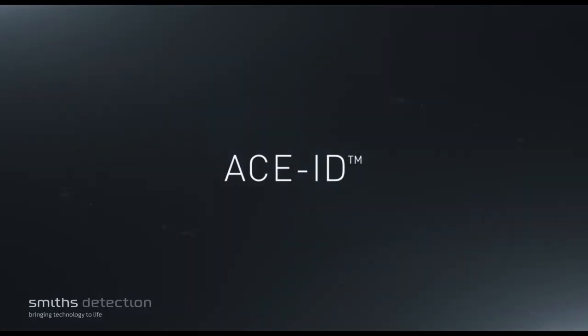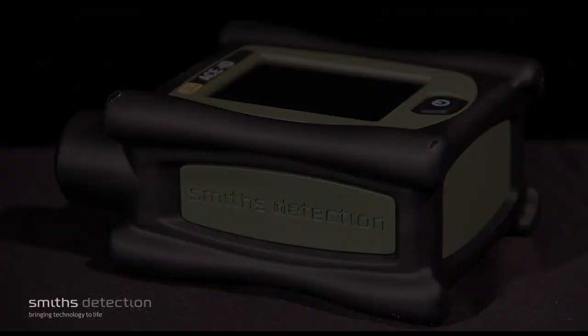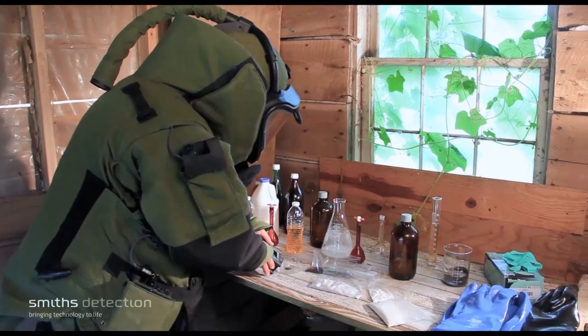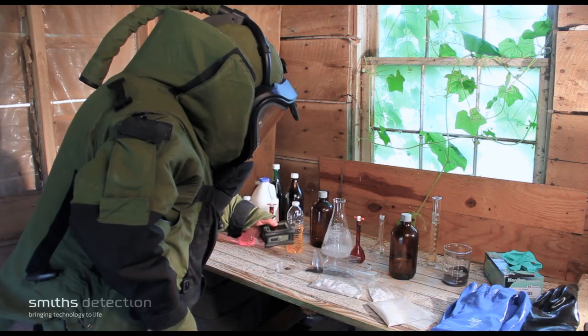The Smith's Detection ACE-ID is a next-generation handheld Raman identifier for explosives and precursors as well as narcotics and toxic chemicals. It identifies solids, powders, and water-based solutions, and also performs mixture analysis.